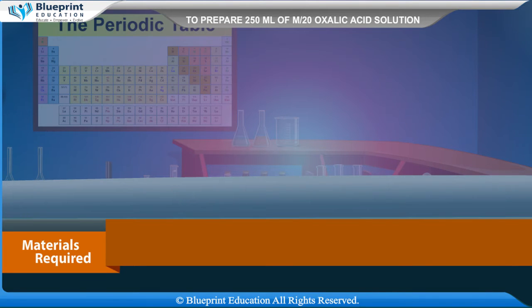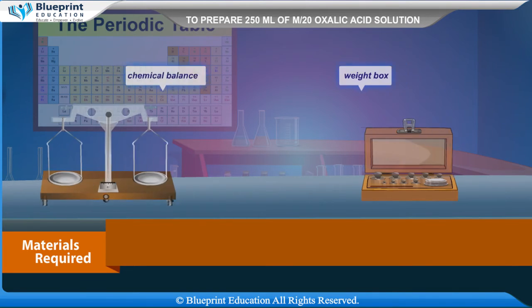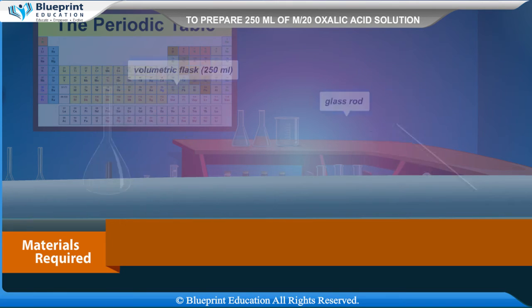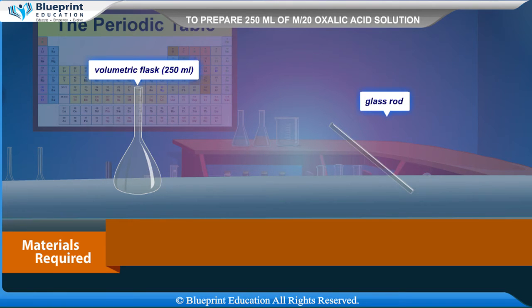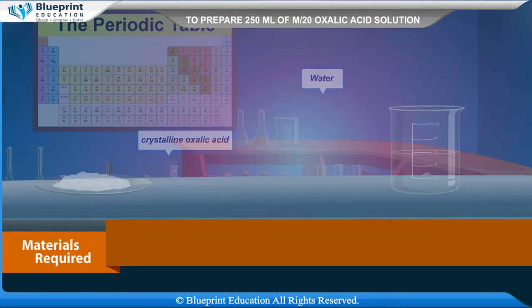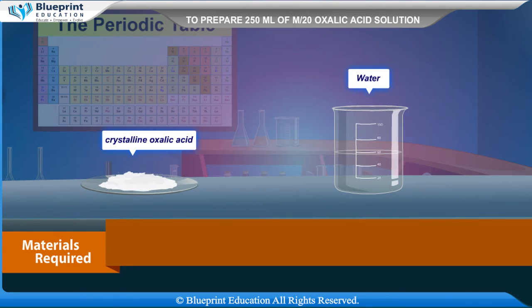Materials required are: chemical balance, weight box, volumetric flask (250 ml), glass rod, beaker, watch glass, crystalline oxalic acid, and water.